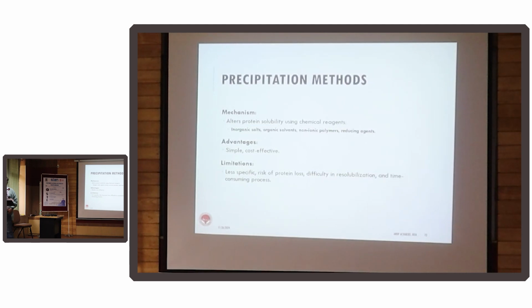Fact of the matter is, if you are looking for the perfect method, you won't find any perfect method. Every method will have its limitation, right? That limitation might be money, that limitation might be a lack of sensitivity, but whatever you follow, please follow one method. Don't jump from one method to another, at least in one practical experiment. Don't do depletion columns, top 14, for the first 15 samples because you had money, and suddenly you got hit by poverty and moved to precipitation methods, and 20 you did with precipitation.